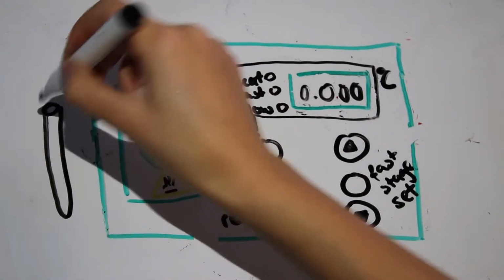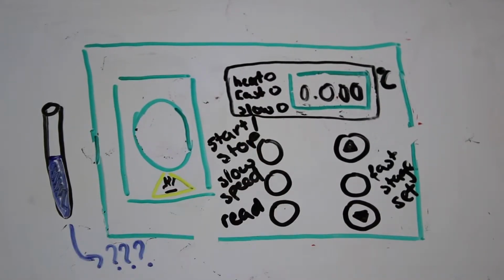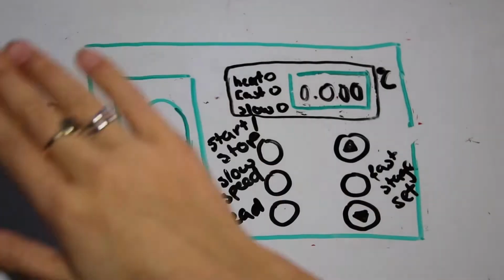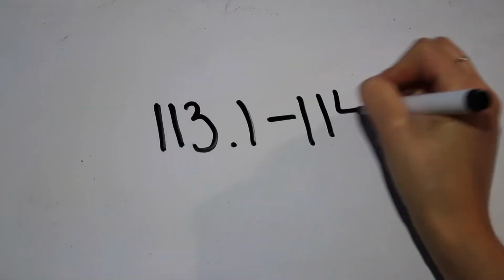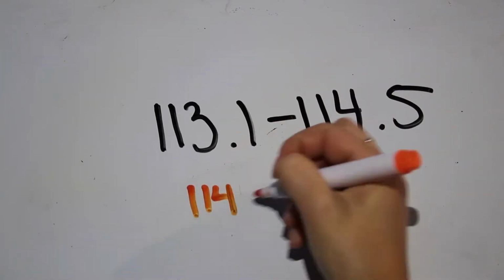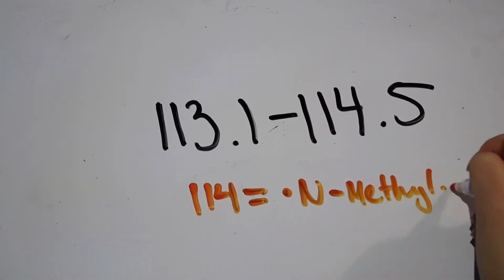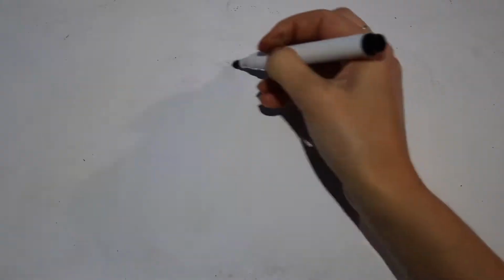Now for the meat of the practical. Get your unknown sample from your demonstrator by showing you've completed the last step. Use what you've just learned to perform another melting point determination on this sample. By looking at the list, you will find two compounds that have melting points similar to what you've just found. The next step is to find which of the two your sample happens to be.